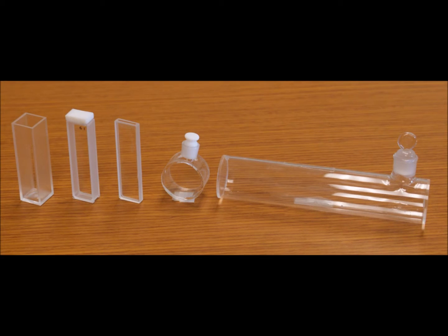One practical and very useful attribute of conventional IR spectroscopy is that solid, liquid, and gas samples can be analyzed. This is also true of FTIR spectroscopy. Each phase will have to be held in a different sample holder, but all phases can be analyzed, given the proper sample preparation procedure was followed.